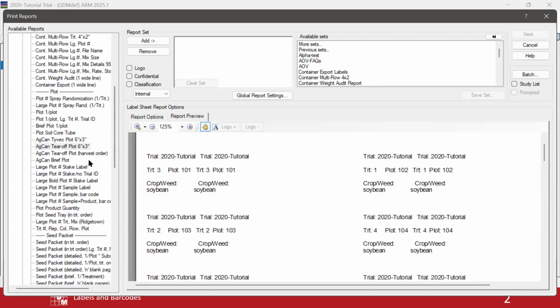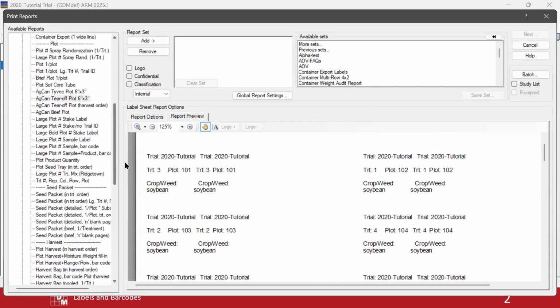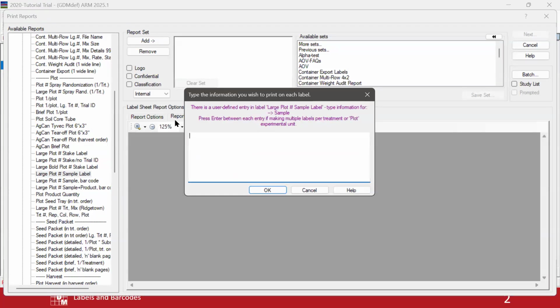So some of these have something like that. It's also possible for subsamples. I was thinking some say subsamples, probably number of samples here. So if I go to this one, it's the same idea that there's this extra information we want. This one, it's telling us sample.